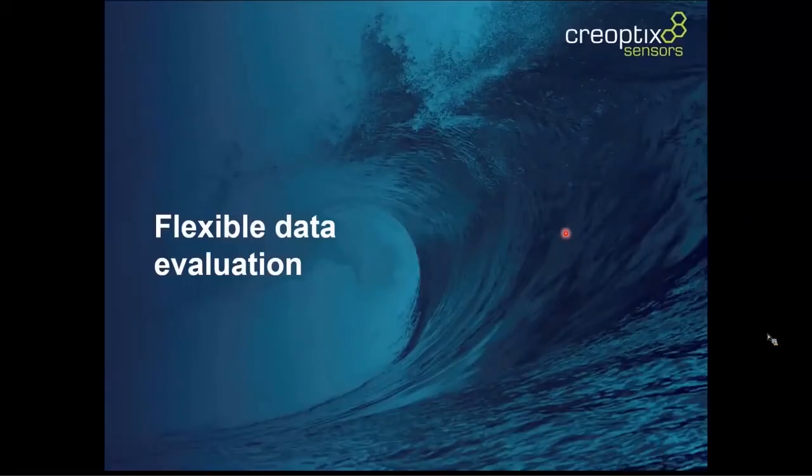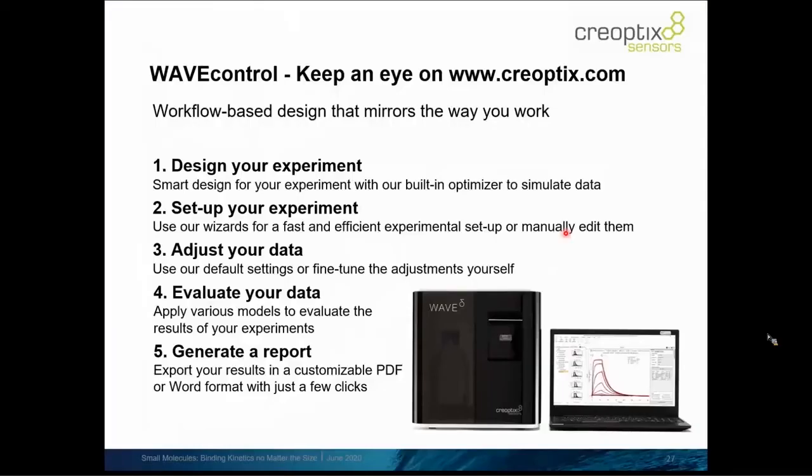A few words about data evaluation. So WAVEcontrol, the software has quite plenty of features, and it's kind of an all-in-one package that enables you to go from designing your experiment.